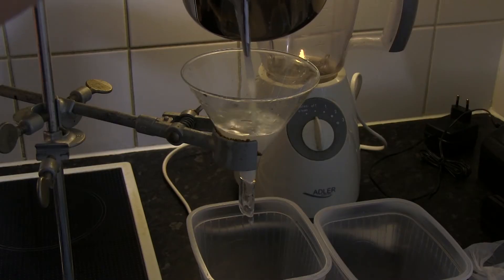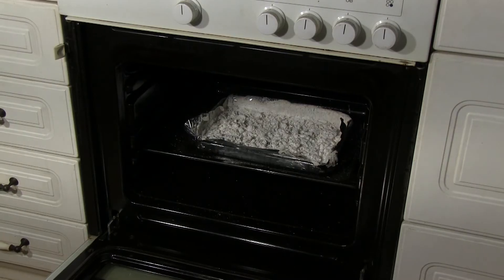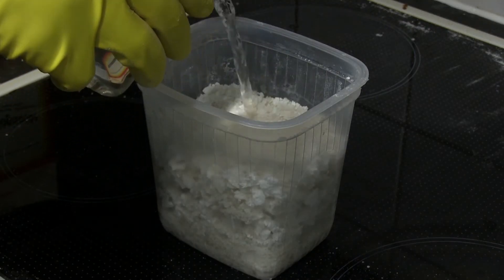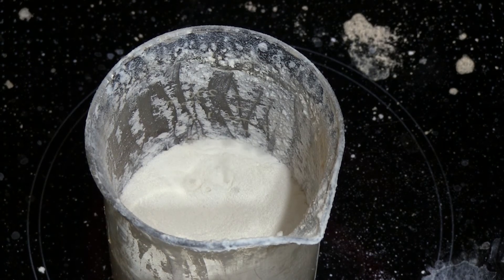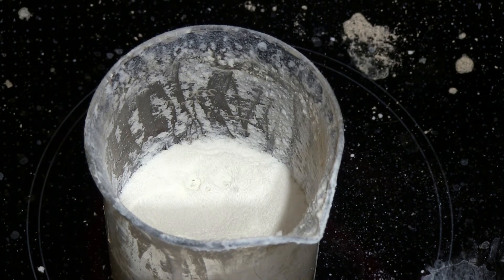Once cooled down, leach the sodium silicate using water. Filter the water. Add acid until the silicic acid precipitates out. After neutralizing the acid, dry everything in an oven. Leach out water-soluble parts like sodium salts, then put the solids in high heat and dry it.